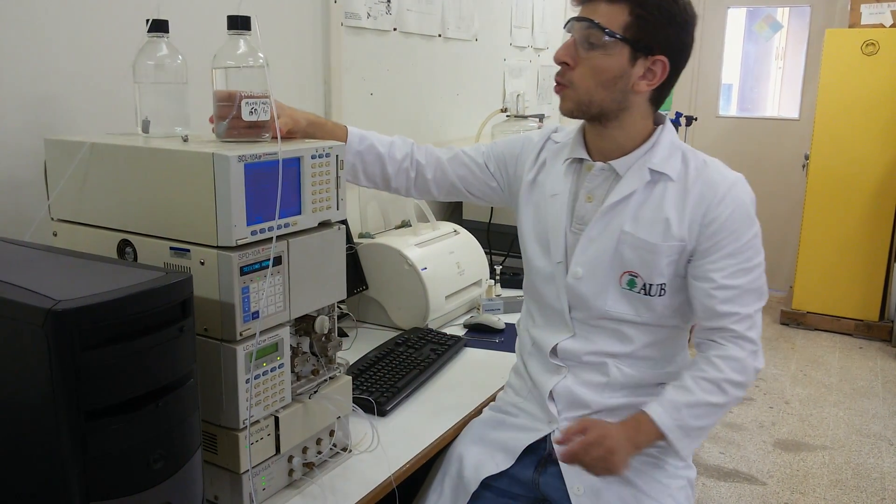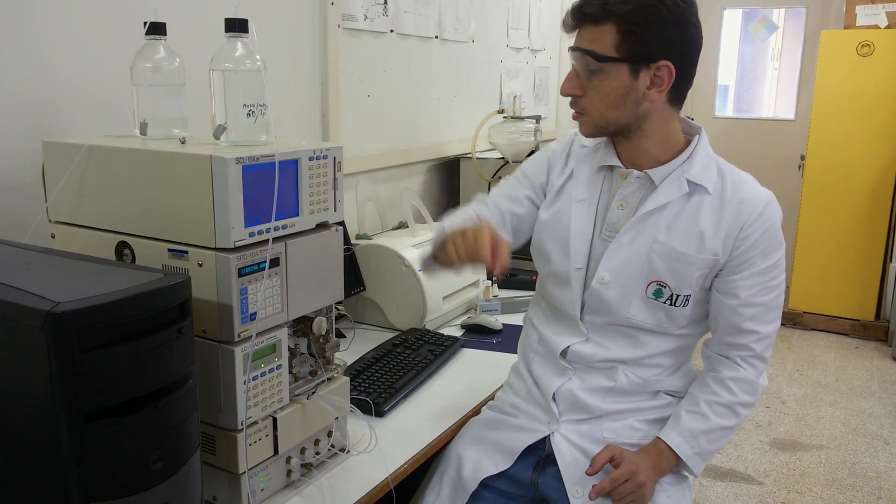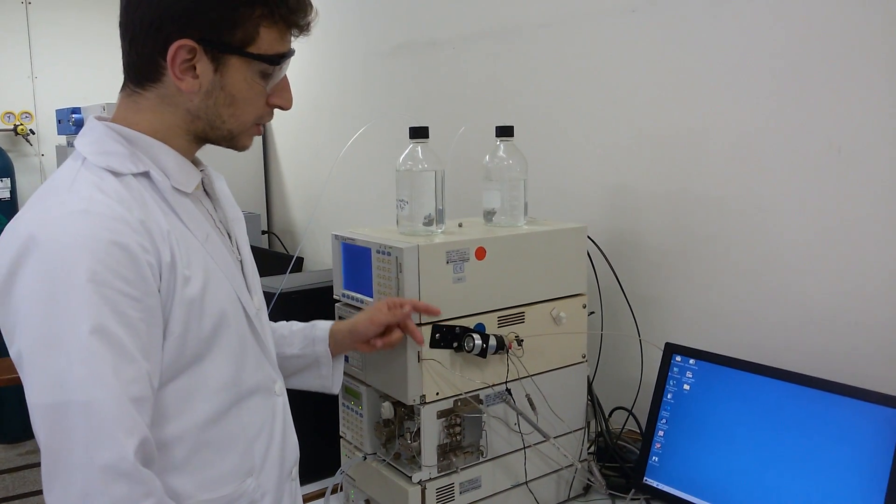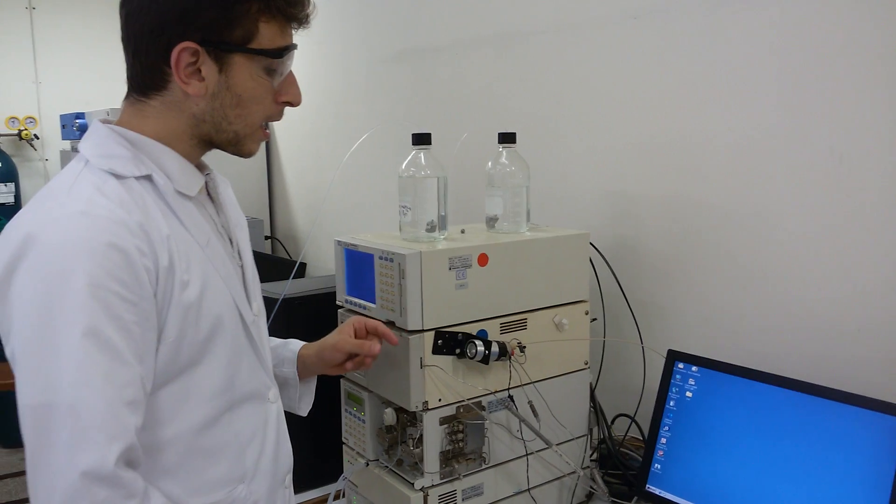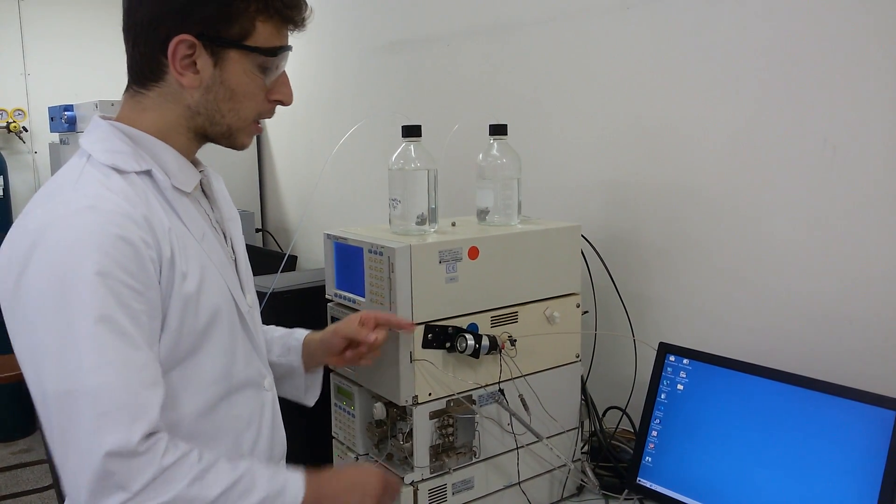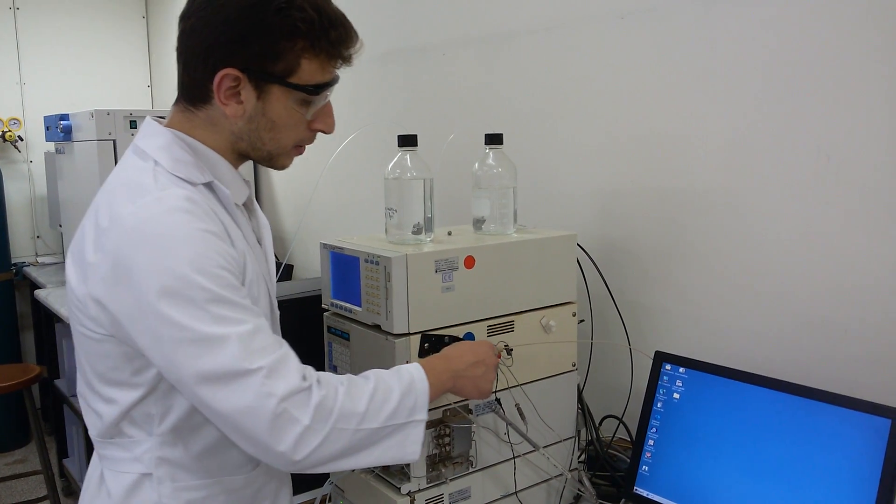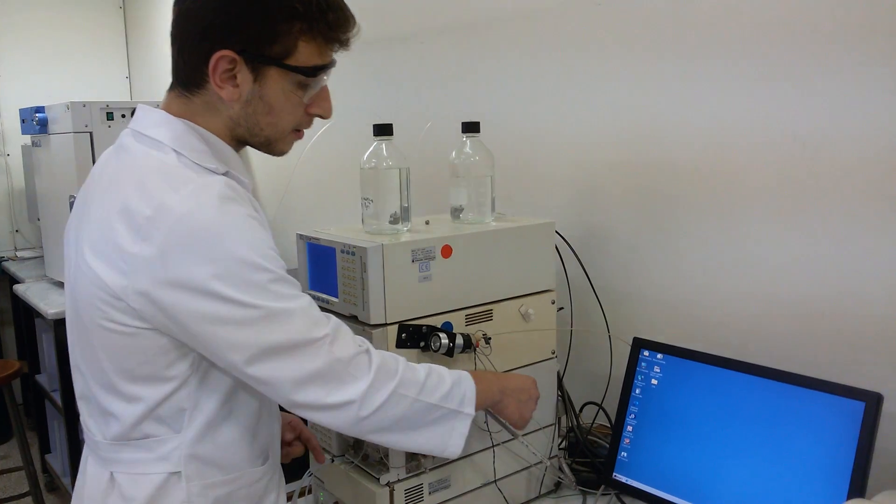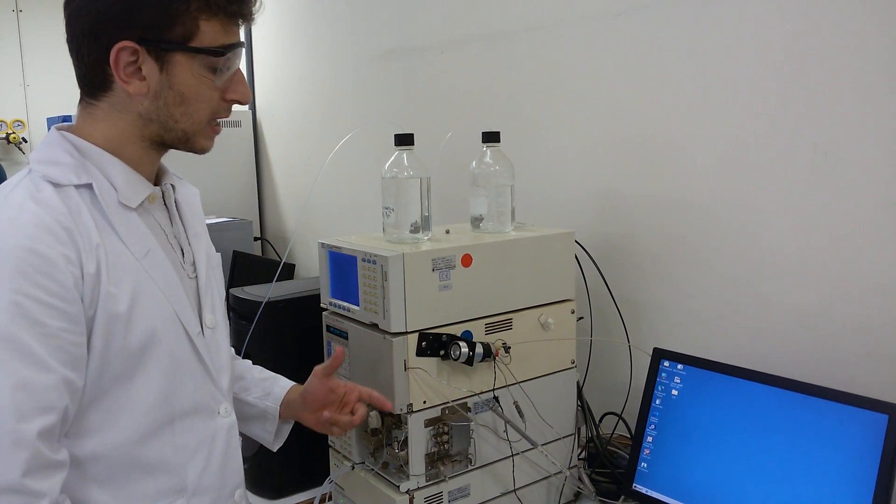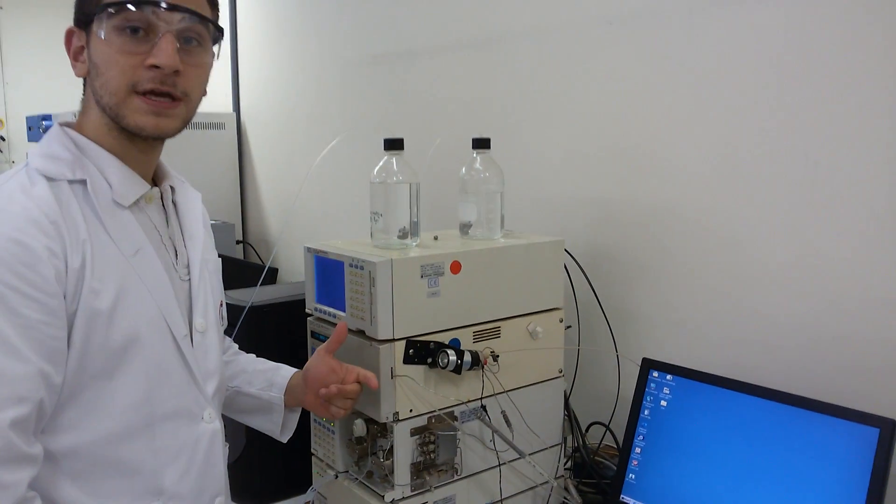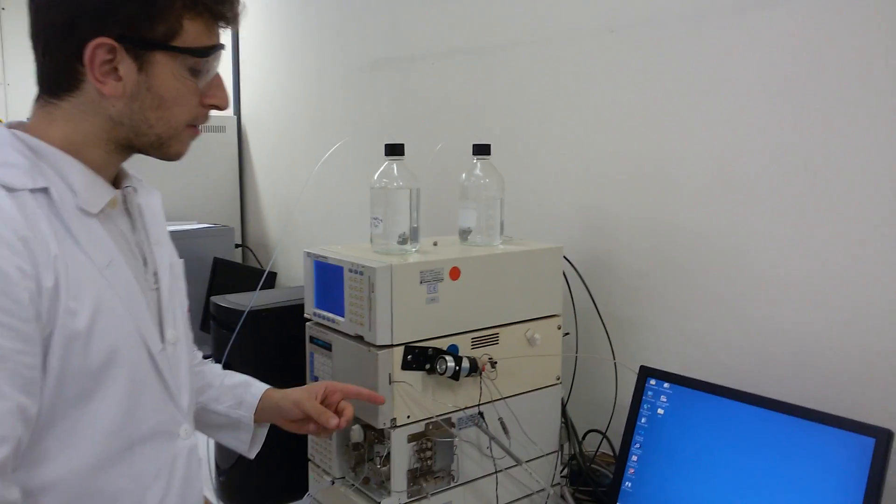The pumps will press the mobile phase into the injector. So, this is our injector. With the syringe, we inject our sample inside. The mobile phase will come and carry our sample through the loop. The loop will then transfer our sample through the guard. This guard serves as our last filter in order to remove every impurities in our sample.